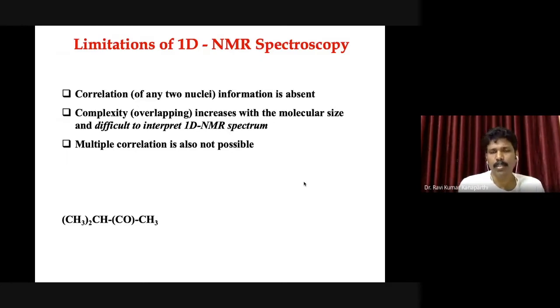Three-dimensional chemical shift values are very familiar in clinical diagnosis. That is MRI imaging, right? There the scanning is done based on the chemical shift values. Three resonance frequencies are basically recorded continuously based on the water, and then the image is generated. So that is a three-dimensional thing. But what we are going to discuss today is the two-dimensional.